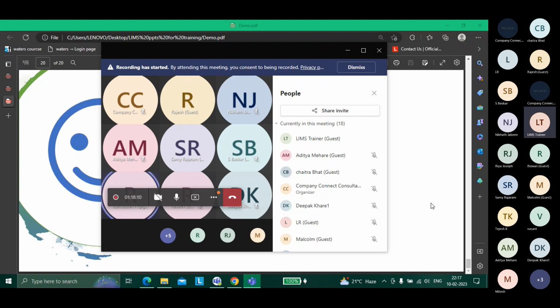When you talk about creation, what? I am giving you a tool, I am creating workflow, but I'm not creating the tool. Backbone is built and sent to me. Okay, we'll discuss this in the later chapters. They are not creating Labware LIMS, wrong. If anyone tells you I'm developing Labware LIMS, wrong.